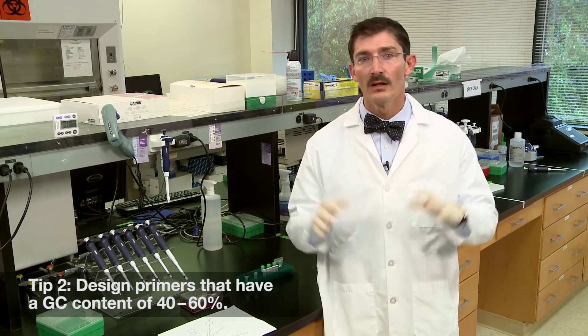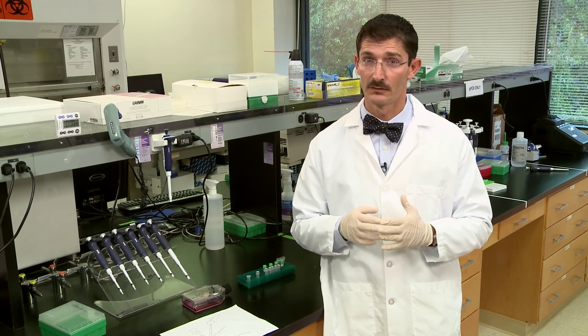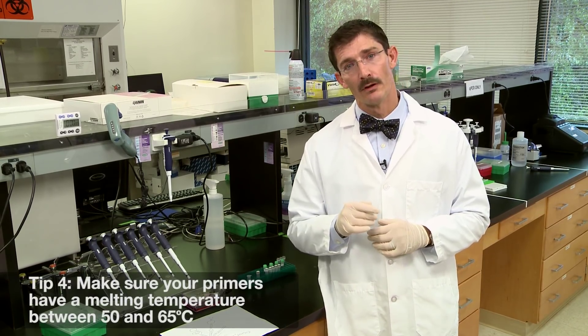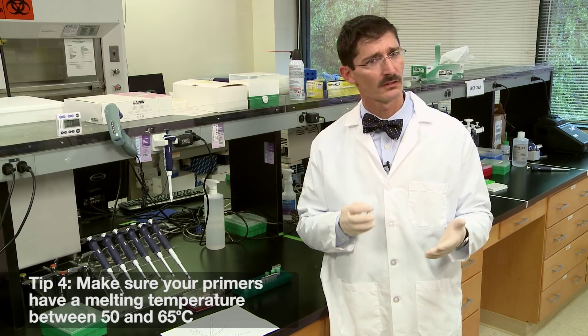Tip number two: design primers that have a GC content between 40 and 60 percent. Tip number three: avoid sequences with long repeats of a single base — anything more than four is no good. Tip number four: make sure that your primers have a melting temperature between 50 and 65 degrees. There are a lot of online calculators that can help you determine the melting temperature.